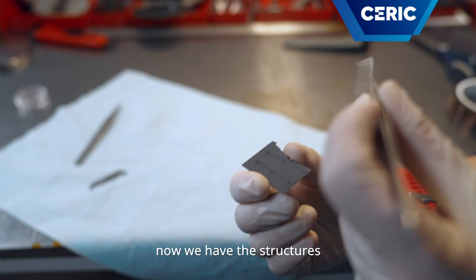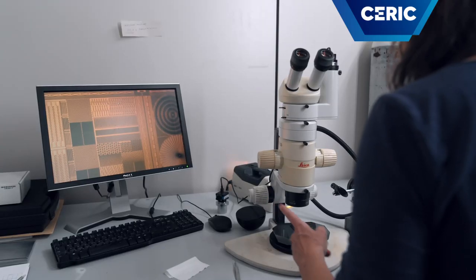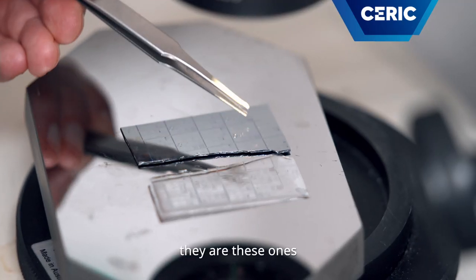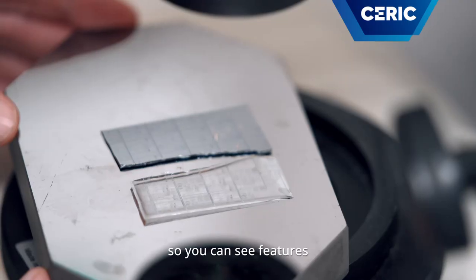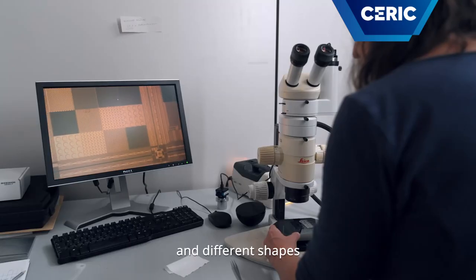Now we have the structure and the replica. These are the original structures of the sample that we replicated. They are test structures just to check if our process went well. You can see features of different dimensions and different shapes.